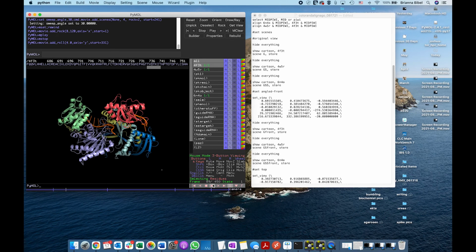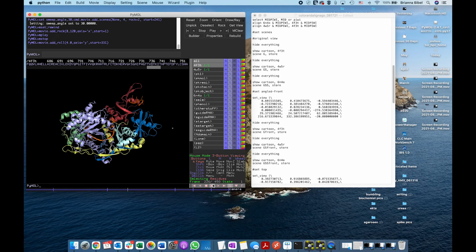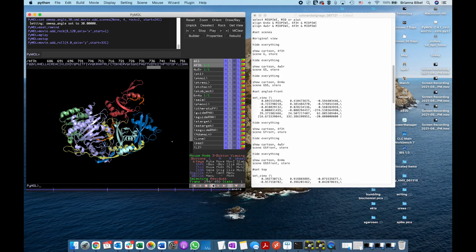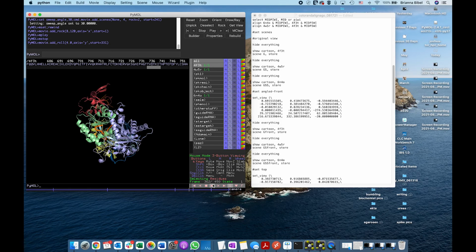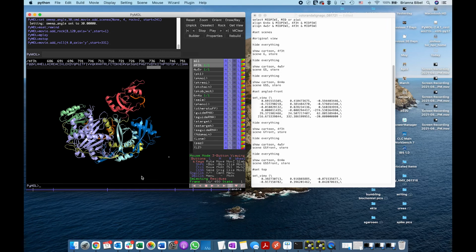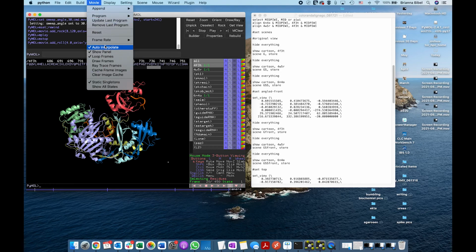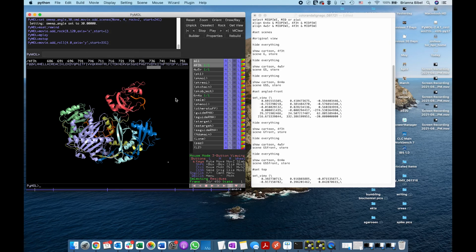So now we're getting our rock, and then because we appended it onto the end, we'll then get our roll. And I'm not sure about the timing and stuff because I don't really use those, but that is a way you can get a movie and then see these different things are different frames and different key points that it interpolates. So right now it's on auto interpolate, which means if I have different frames, it's going to try to make the smoothest way between them.